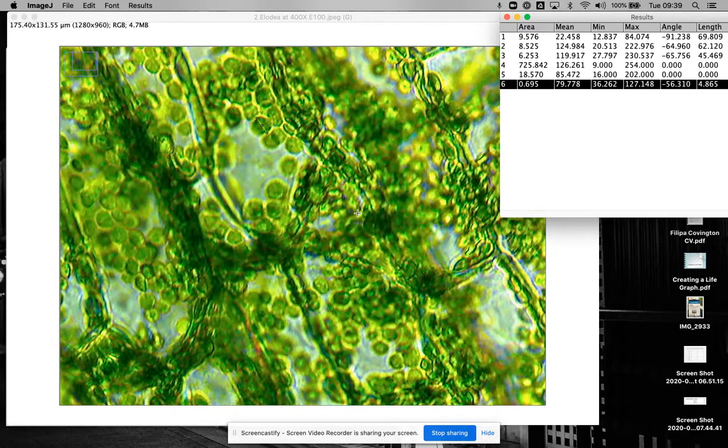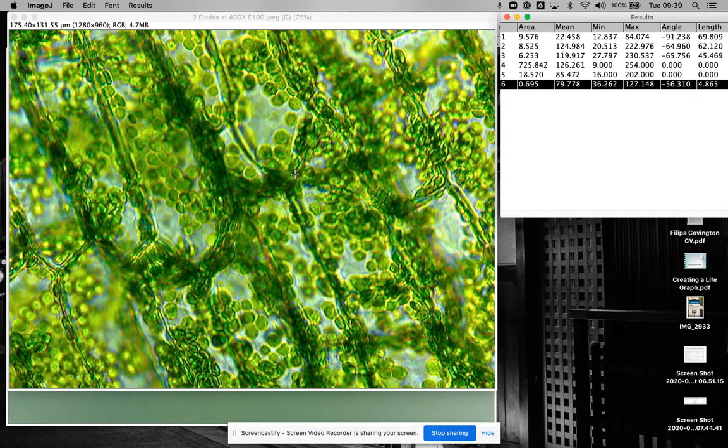So this is a very powerful program. You can do a lot of measurements with this. You can do it fairly quickly and easily. So it has lots of potential IA ideas. So this video taught you how to calibrate it and how to make some measurements.